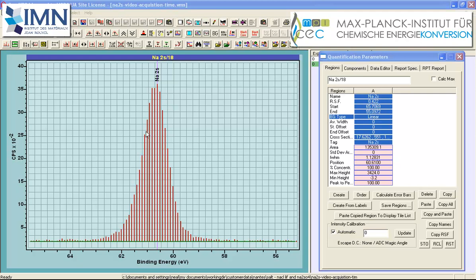It might be assumed at this point in the discussion that noise has very little influence on the calculation of the area of a peak and therefore the intensity of a photoemission peak. However, this is not the case, and the problem is that data bins are involved in the calculation of the background. So the individual intensities and the noise within a data bin that's associated with the limits of a background influence the shape of the curves that then represent the background, and therefore intensities that are in excess of the background that represent the photoemission peak.